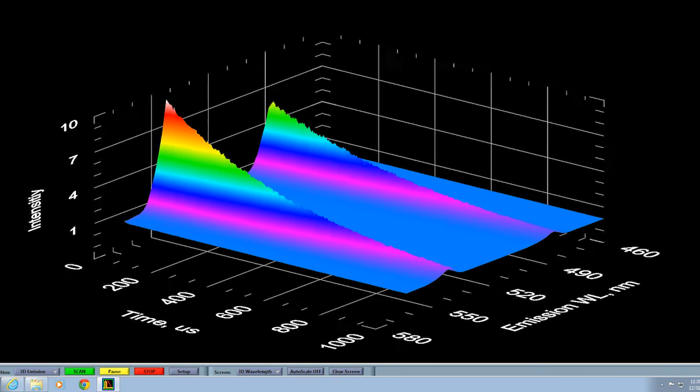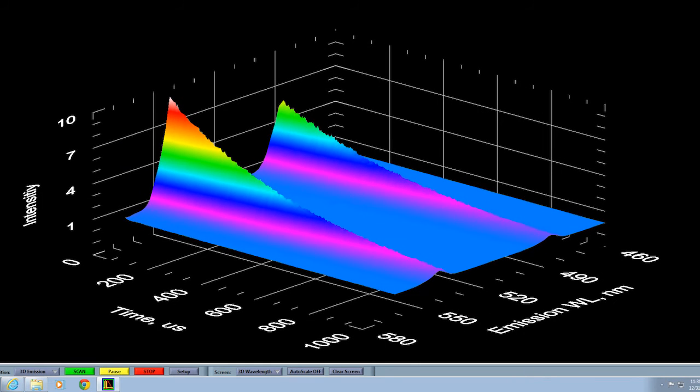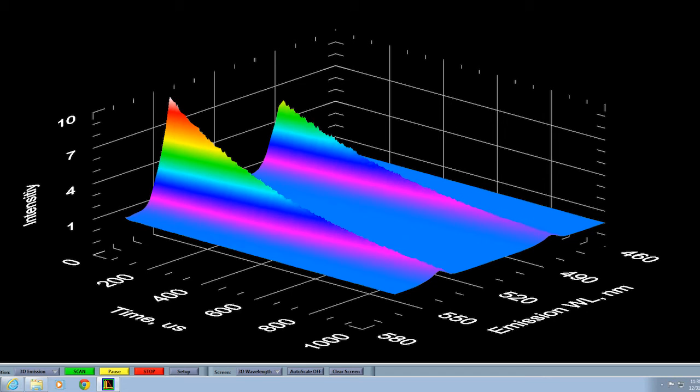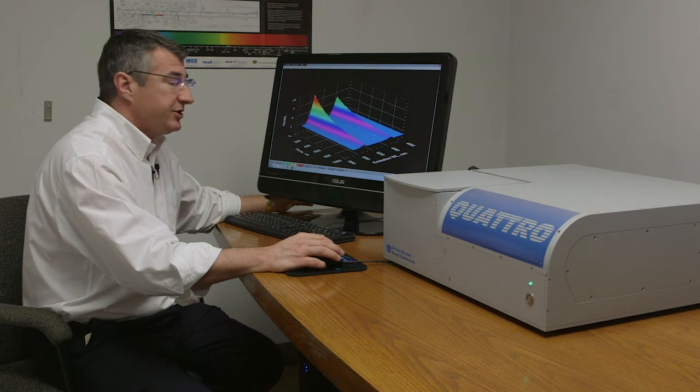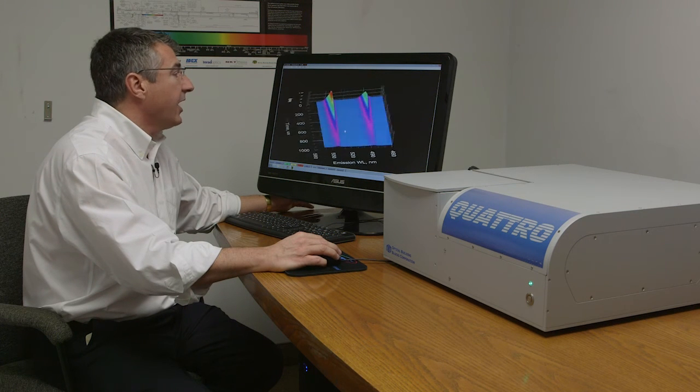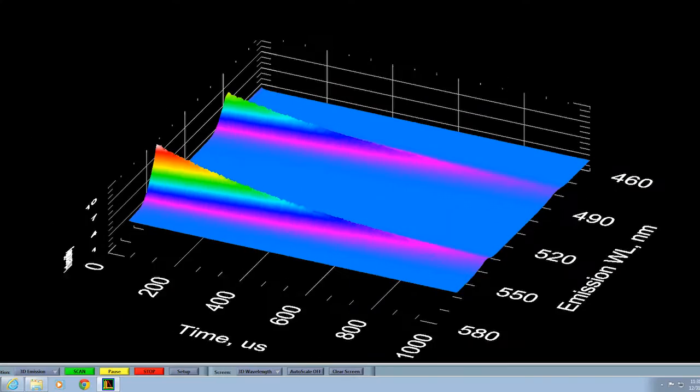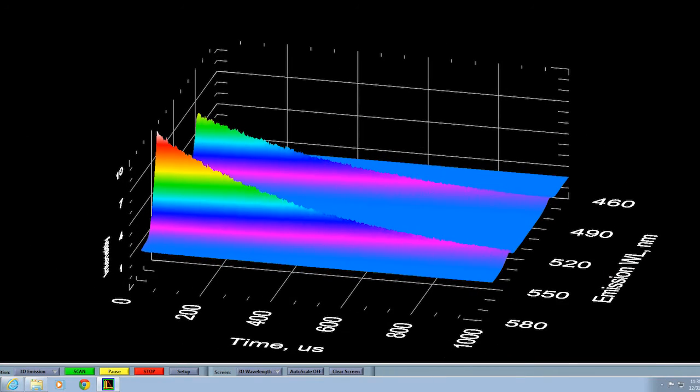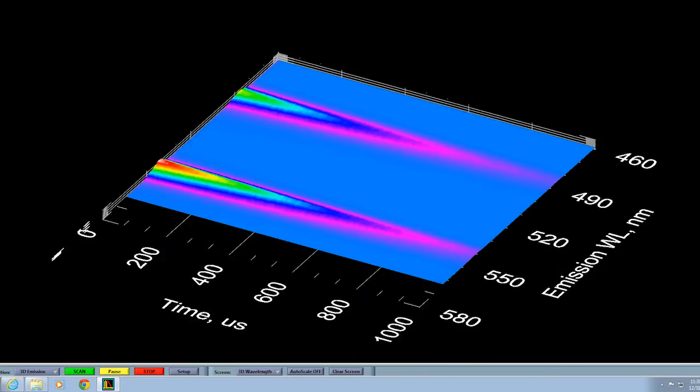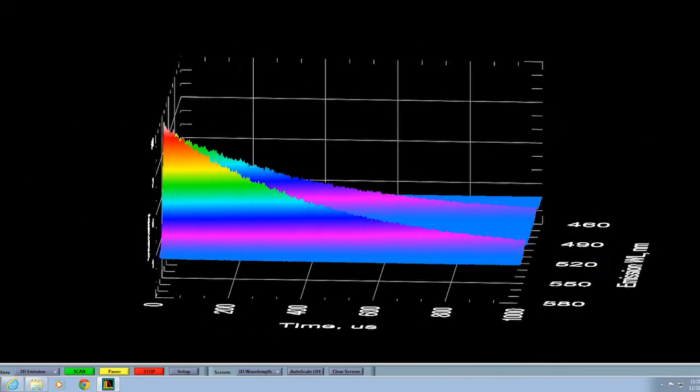Here you can see we've actually collected a number of decay curves at a variety of different emission wavelengths. We've done it only in the matter of a few seconds and we've collected really a lot of quite useful information. We're now looking at decay as a function of emission wavelength and again it can be displayed in a variety of different ways.